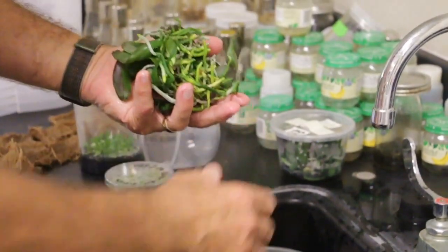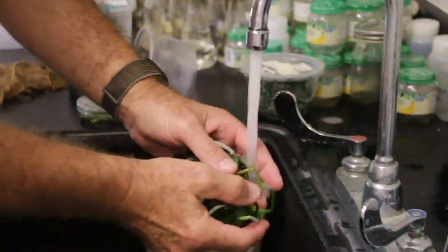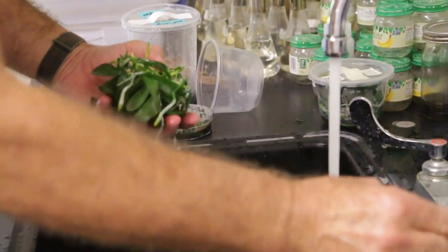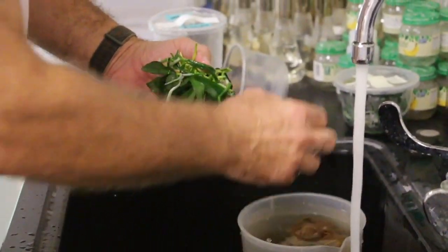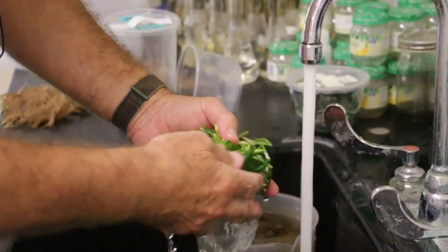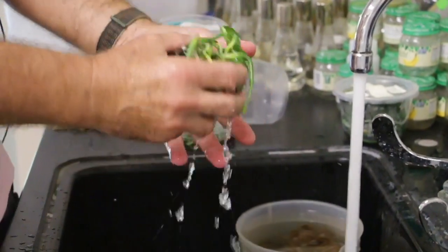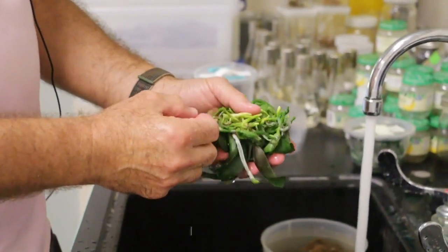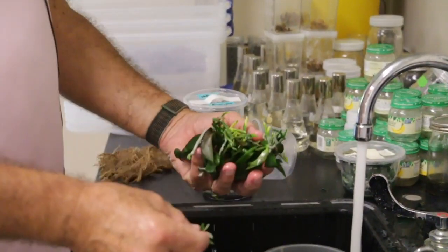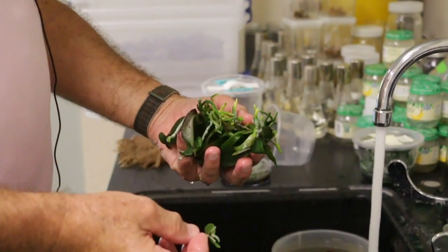This medium that I've developed and use has been kind of optimized for the cattleyas. I'm going to turn this on, hopefully it won't drown me out. I have a colleague who works on phals, and I'm so excited about this, he sent me his Phalaenopsis medium, and I'm so excited to try it. It has somewhat different components. I'll probably make that medium next week and try it, and I'll keep you updated. We exchanged medium formulations, and I told him I wouldn't release his, and he won't release mine, so I just want to try it. We'll see.